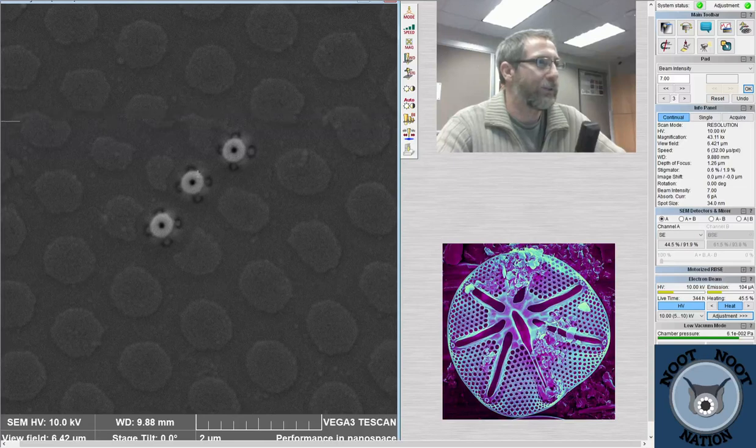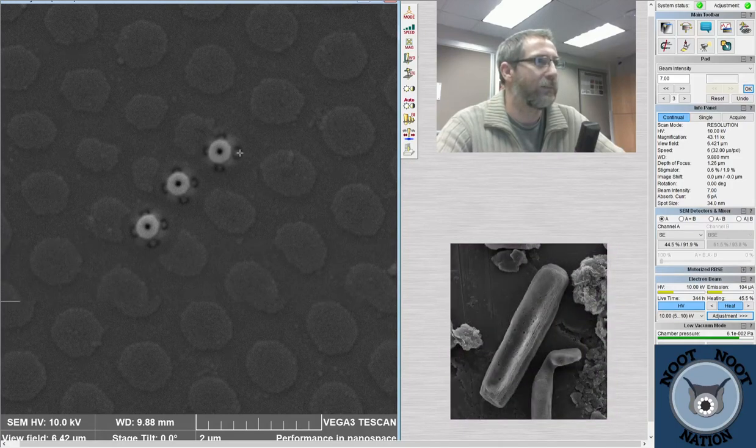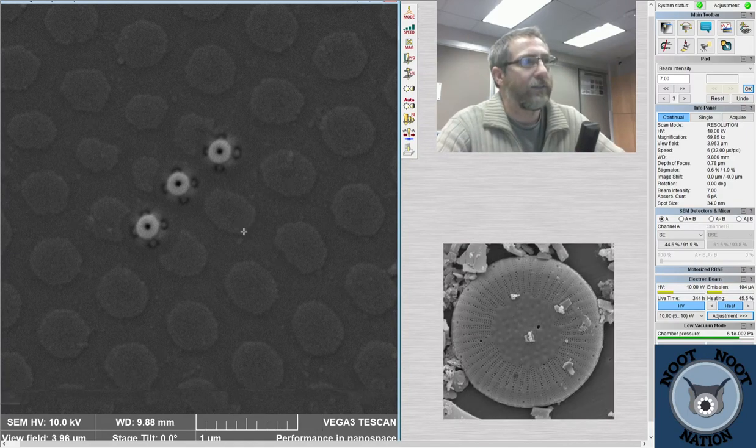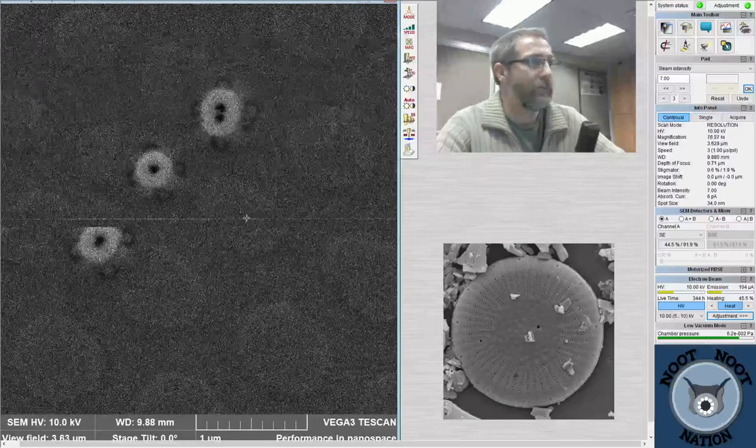And then these things, as I mentioned, are strutted processes, or sometimes called fultoportulae. And these are the valve face fultoportulae. So they've got one hole that's in the center of the diatom's strutted process. And then the strutted parts are these sort of satellite pores that are on the margins of them. And this one has 4 for each one hole in the center. They don't always have to have that.